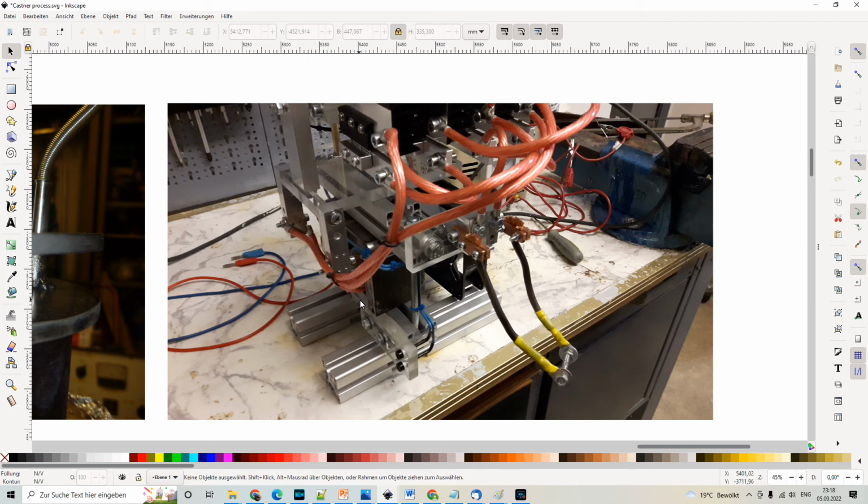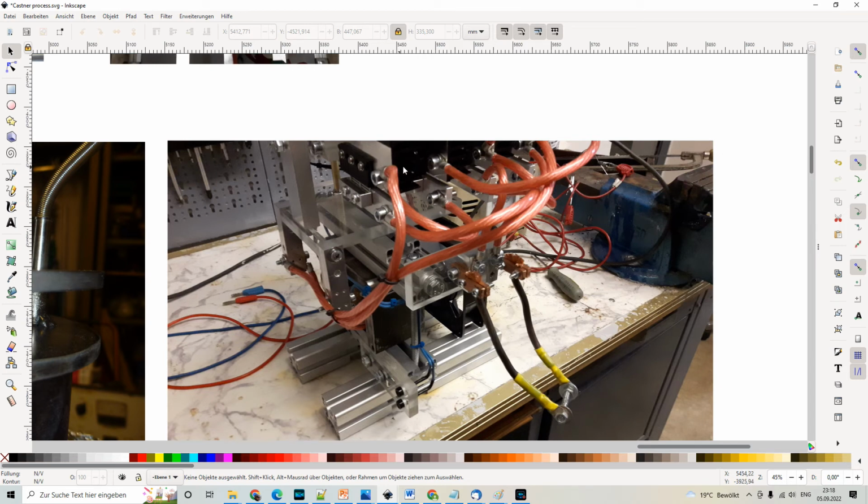for the AC, for the low voltage AC. And what you can see up here, these 4 coolers. On each cooler you have 3 diodes, so it looks pretty fancy, but it's a very straightforward full bridge rectifier. So you can use a microwave oven transformer, kill the secondary, make a couple of windings, and just do a full bridge rectifier, and it will work really fine. Generating between 30 and 50 amps with this device was not a problem, so it was perfect for the electrolysis.